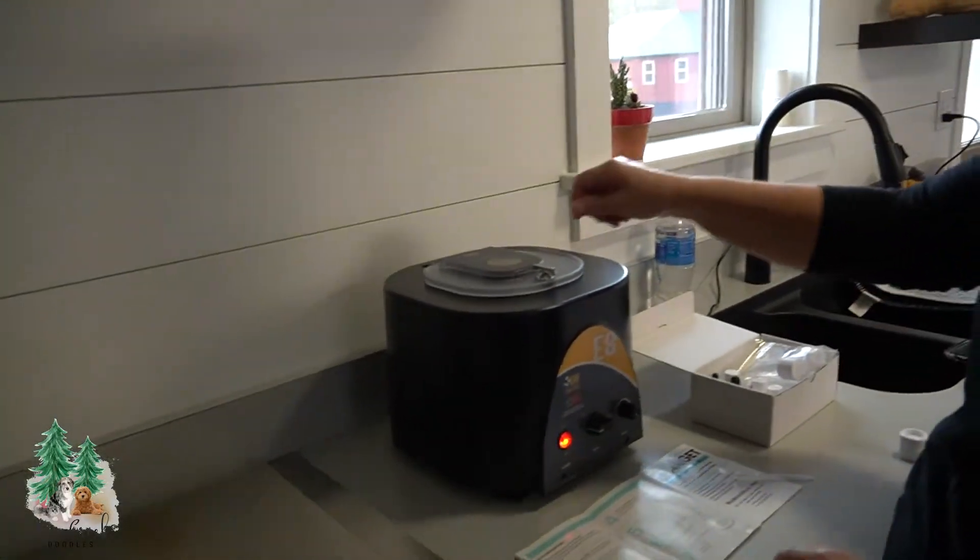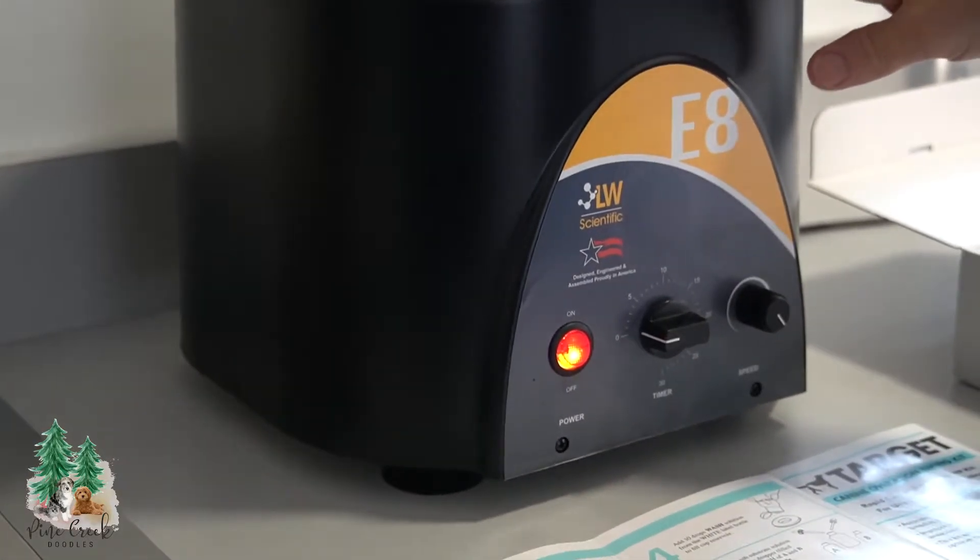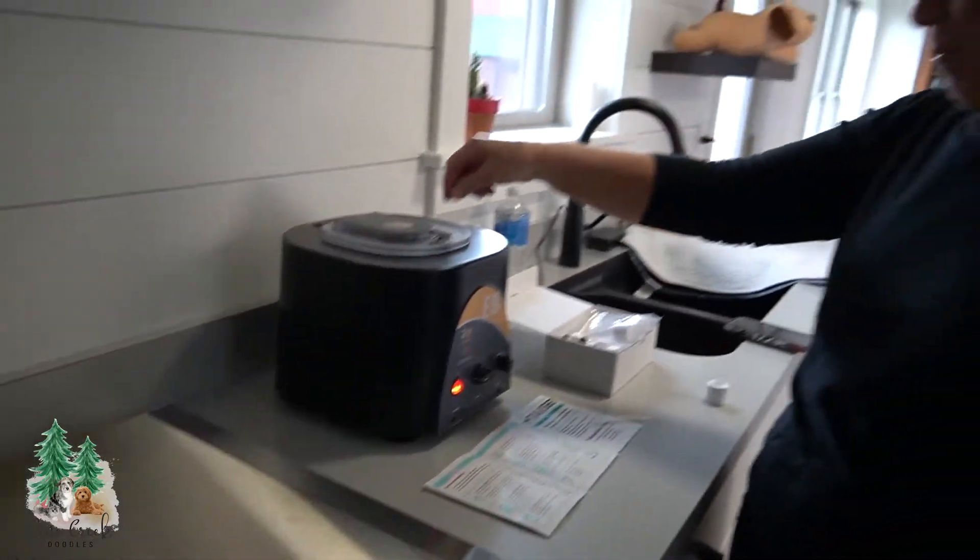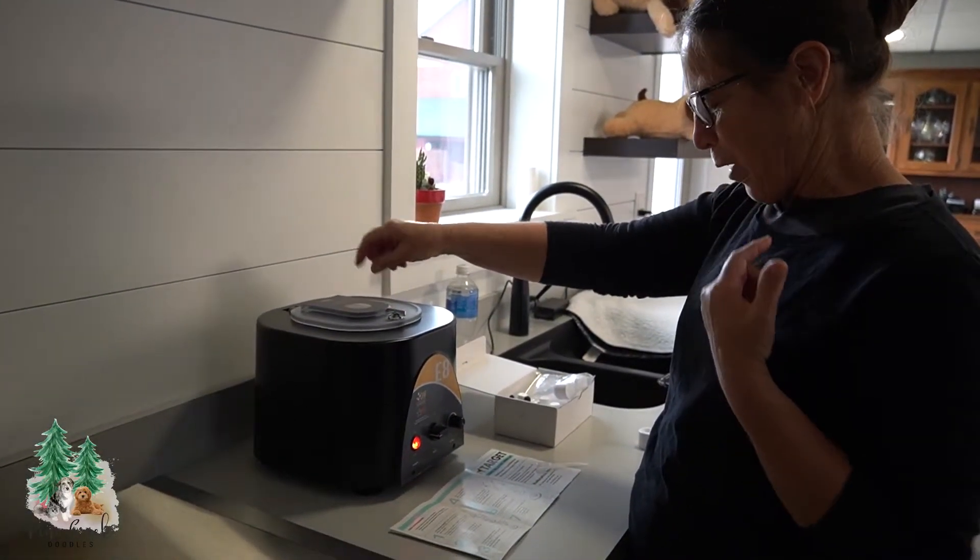Okay, so explain what you're doing here. So this is my, I'm not sure what I want to call it, it's my spinning machine is what I call it to test my females to see if they are ready to be bred.